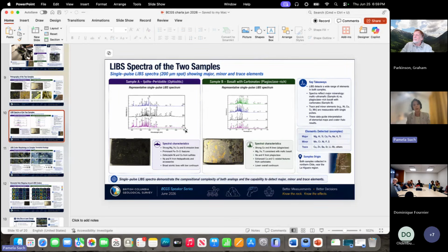But if you're working in carbonates, for example, you know that LIBS can affect a broader area of the sample. So maybe you want to clean up to 5 millimeters at least of the core sample, for example for people who work in deposits with carbonatic veins. So you want to clean your sample better, or you leave LIBS for the very last and perform all the other non-destructive analyses before. Sorry, you asked about quantification and I went off on a tangent.